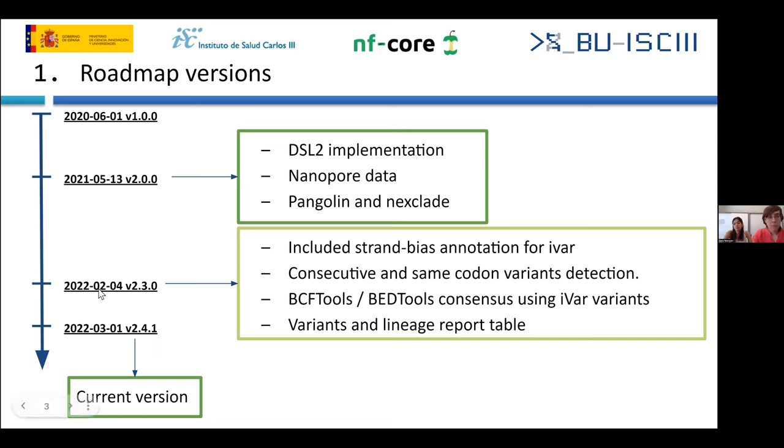Just a few months ago, in February, a new release, the 2.3, was published, including some fixes regarding problems or decision taking from iVar consensus. We're going to talk about this functionality deeper in the next slide. Currently, we are in version 2.4.1. And this is the major functionality we've added.